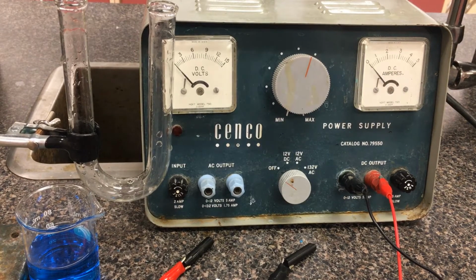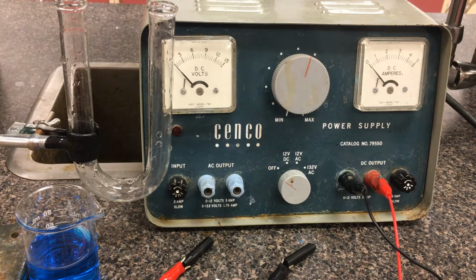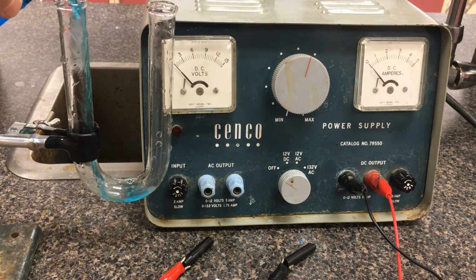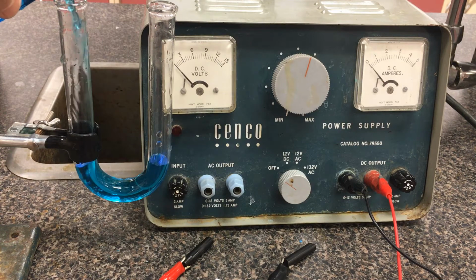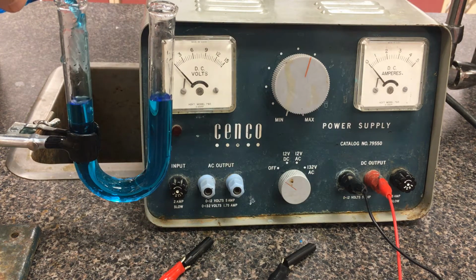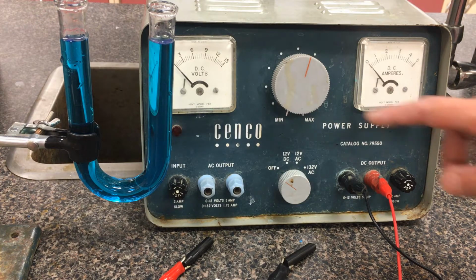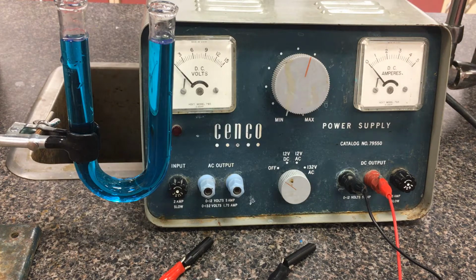Okay, so for part 2 of this electrolysis lab, this time we're going to do the electrolysis of a 1 molar copper(II) sulfate solution. This one is already a very deep blue color. We're going to fill up the U-tube again. Remember, my variable power supply is going to send in 9 volts. That's the electrical voltage that we're using to force a reaction to happen.